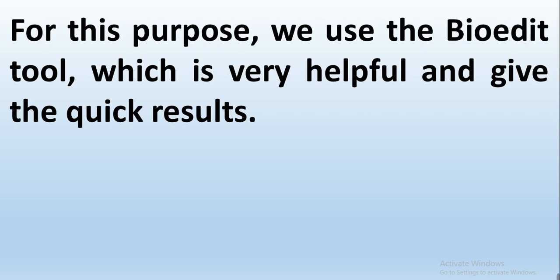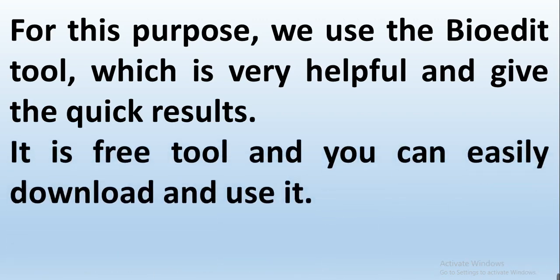So we will compare whether our sequencing results are a 100% match with it or not. Bioedit is very helpful for determining such results and gives quick results. It is a free tool and you can easily download and use it.